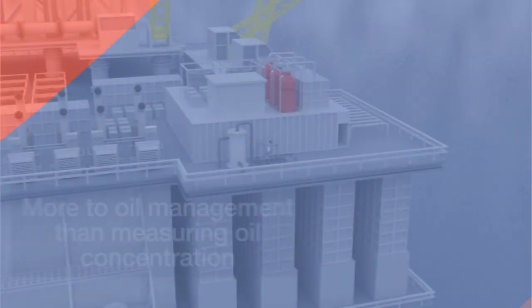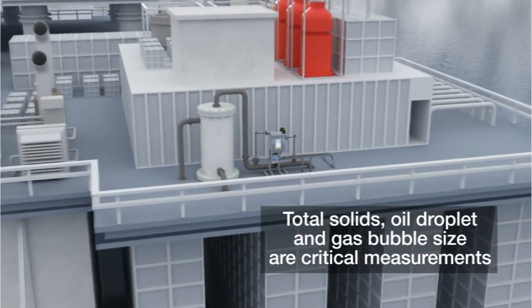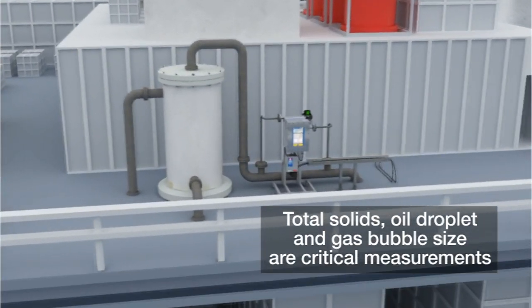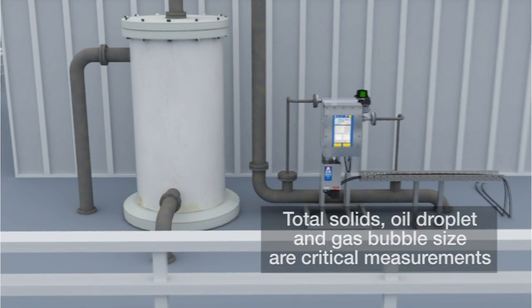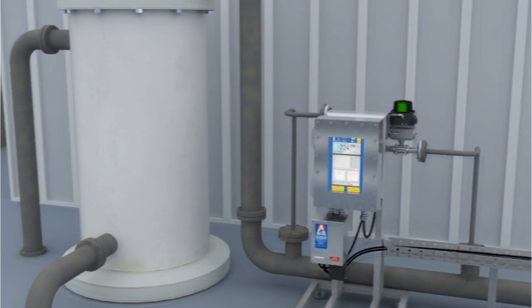There is much more to water management than simply monitoring oil concentration. Total suspended solids, oil droplet size, and gas bubble size are critical measurements at certain process steps within a produced water system.